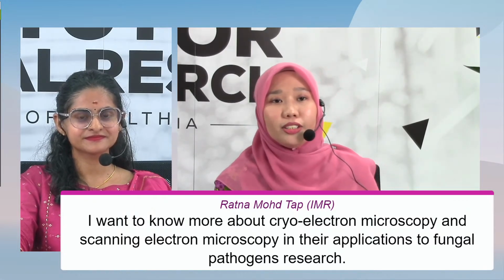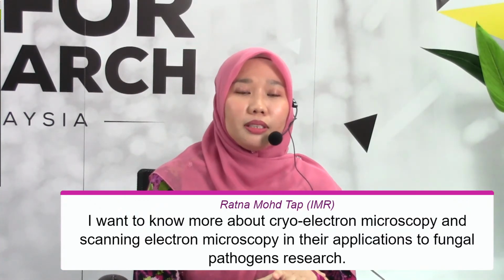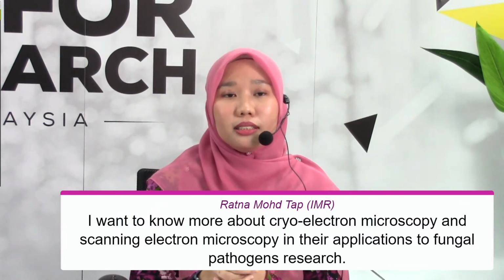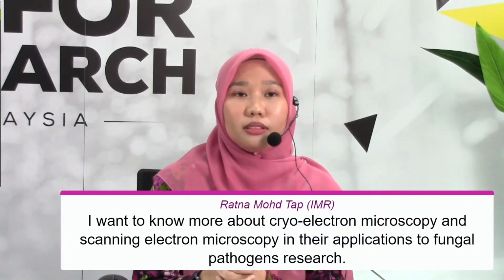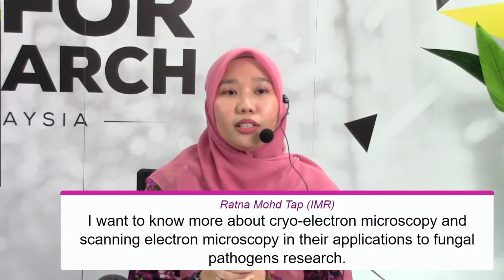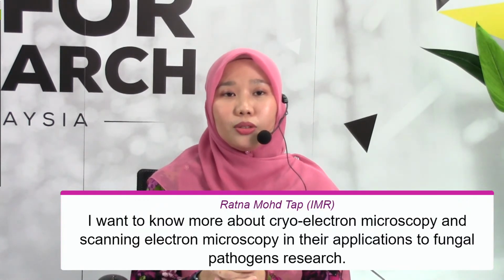Okay, thank you, Ms. Ratna, for the question. So basically, now about the cryo-electron microscope and SEM. Actually, in Malaysia, the cryo-electron microscope is still not available yet because the machines are very expensive, and also the maintenance takes up a very huge budget to have the cryo.